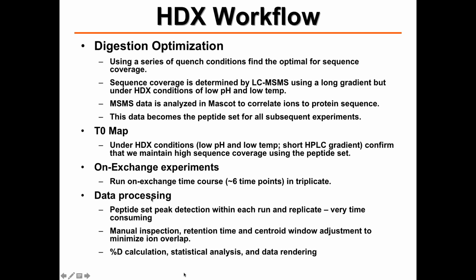And this is where everything comes crashing to a halt. So you can do all this stuff really fast. Now the software has advanced significantly in terms of doing the peak detection within each run and replicate using that peptide set. I wrote very time consuming, but that was for the next one, actually. The manual inspection is what's time consuming.